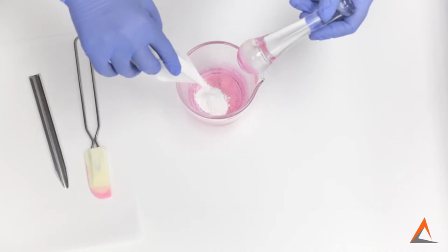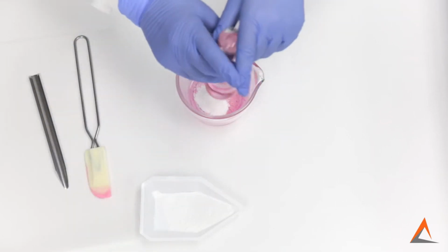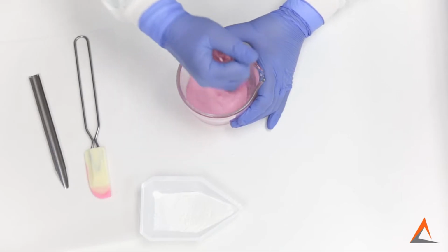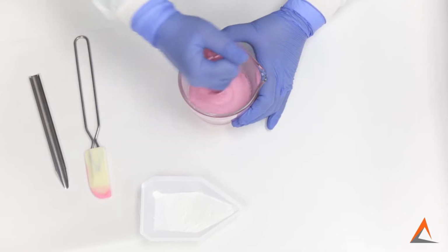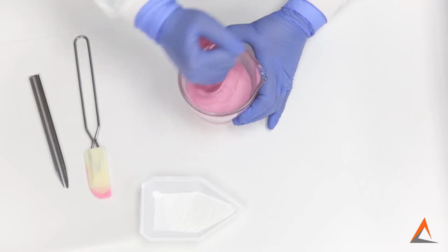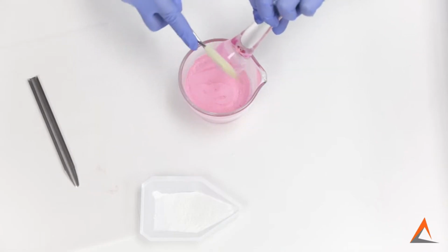Instinctively, it may seem okay to just dump all the powders together in the mortar and mix. With this process, it is very difficult to effectively mix all the powders and get them distributed evenly throughout the blend. With geometric dilution, since we are doubling each mixing process, you are able to achieve a homogeneous mixture. Even though geometric dilution does take more time, it is definitely better practice. Once again, scrape down your pestle and sides of the mortar.